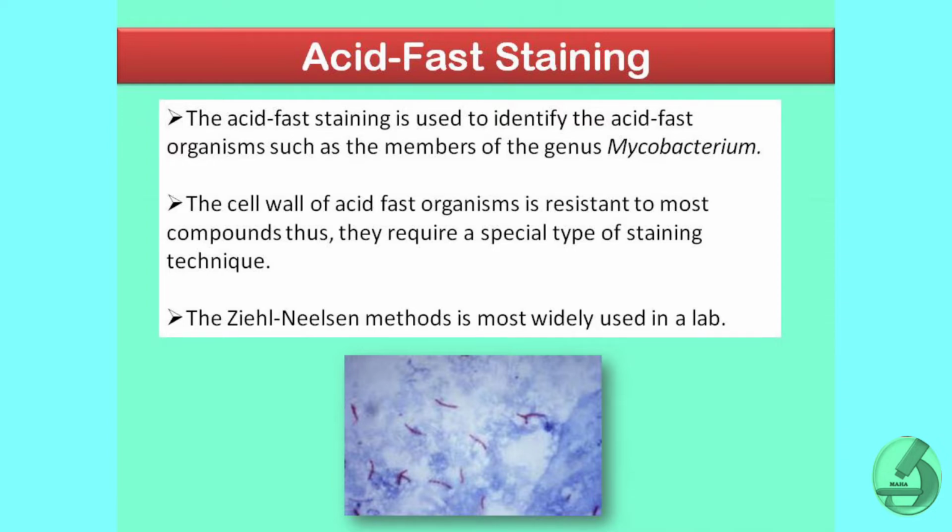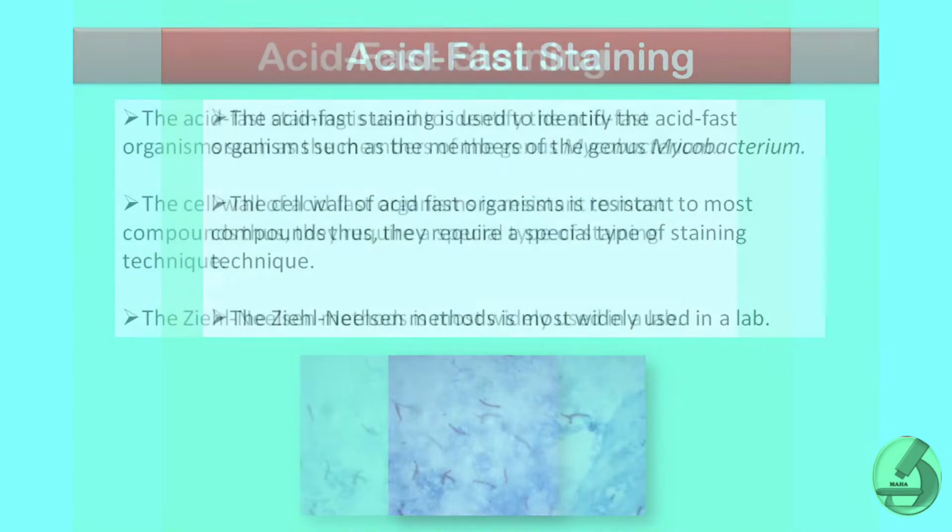The cell wall of acid-fast organisms is resistant to most of the compounds, thus they require a special type of staining technique. The Ziehl-Neelsen method is most widely used in the lab.